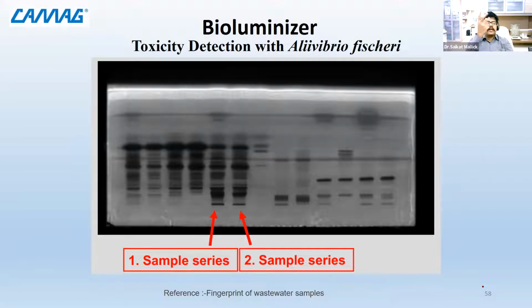It is not a bulb or a tube light that will give you a very bright light, but a very faint light. At home, you must have seen, during our childhood, those stars and things which glow at night. You have stickers which absorb the light, and at night you will see a very faint fluorescent kind of image. That is how bioluminescence light is, and that is very low.